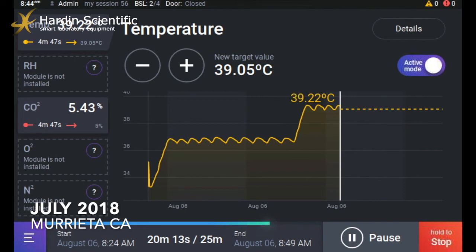So right now the CO2 gas tank is disconnected from the CO2 module. And let's see what's going on in this case. It's not necessary that it has to be disconnected. It can be, for example, that we have no CO2 gas anymore in the tank, and the pressure in the system will decrease down to 0, for example.